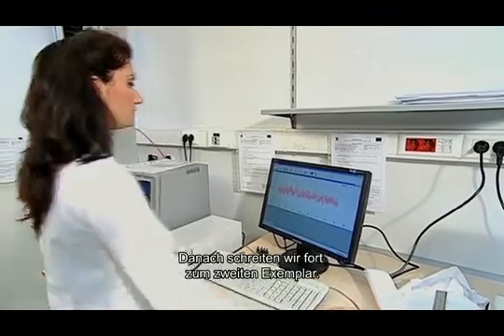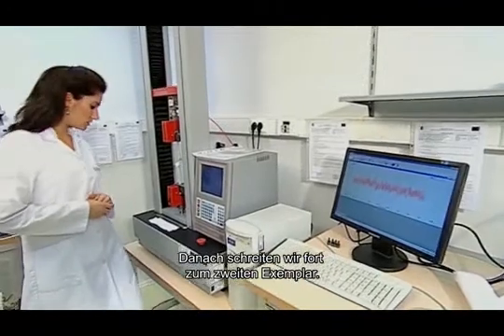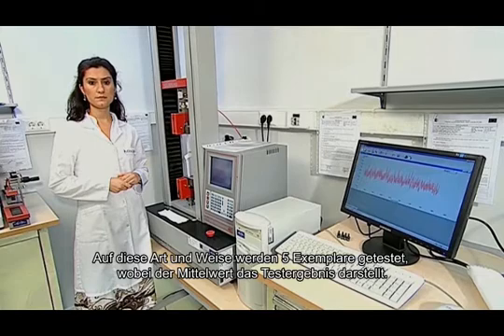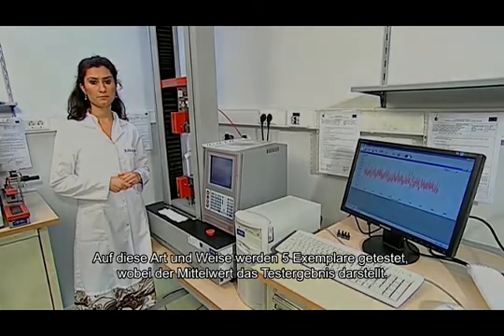Then we pass on to the second test specimen. Testing five pieces of test specimens in the same way, the mean value is given as the test result.